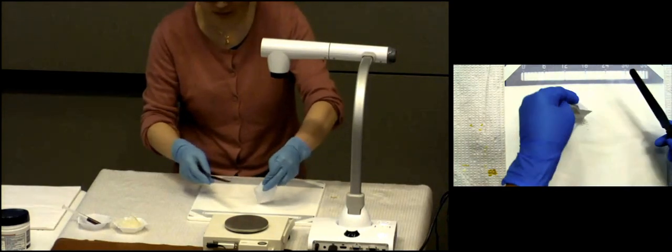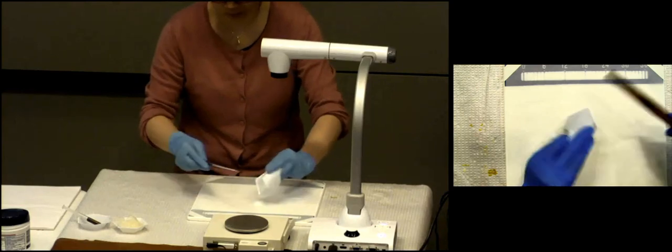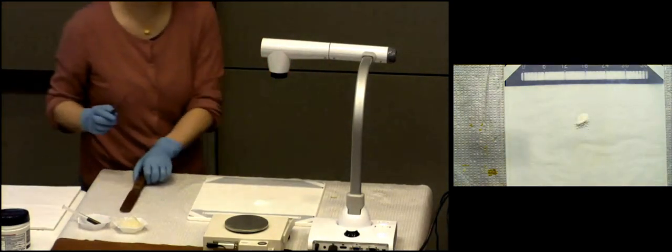Then lastly, at the start of the second sentence where it says spatulate, circle that word. That is an important term you have to use in your procedure, and she'll be doing that up here, so she'll talk about it, but make sure you realize that's an important key term.